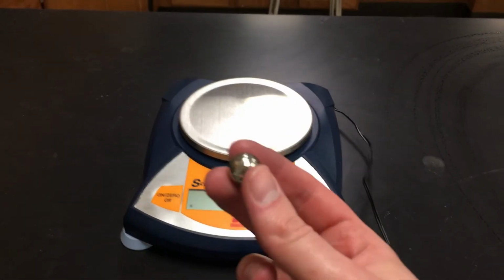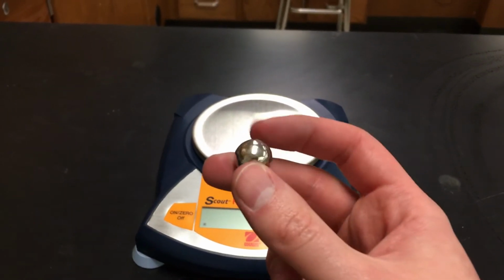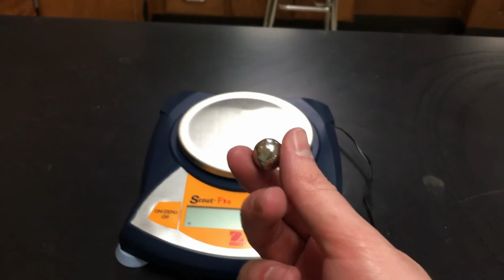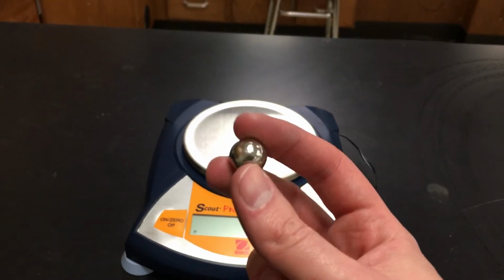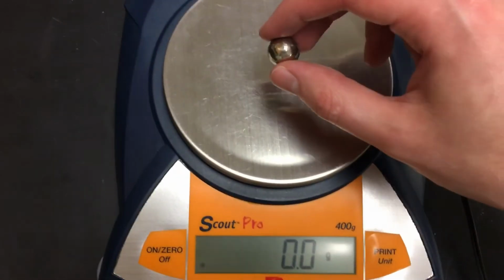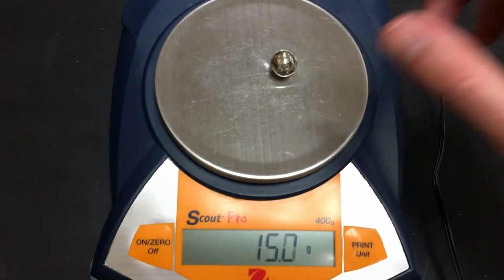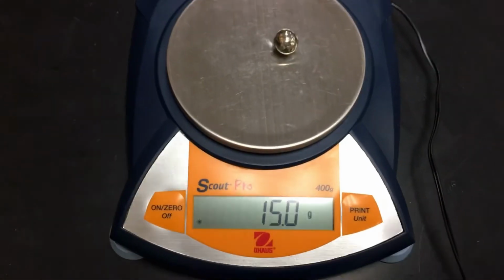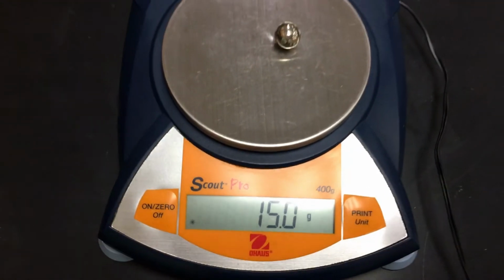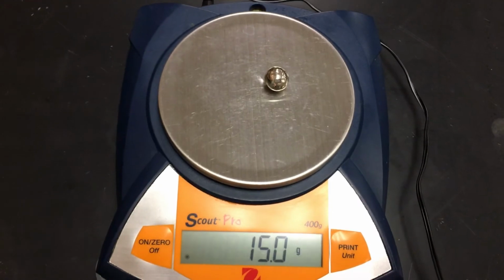I've got a sample of nickel here, and I want to figure out the density of this little nickel marble. So in order to calculate the density, I need the mass and the volume of this thing. The mass is the easy part. I've got a mass balance right here. If I set it carefully on here, I might be able to get it to stay. Yeah, there we go. It reads out 15.0 grams. So there's 15.0 grams of matter in this nickel marble.